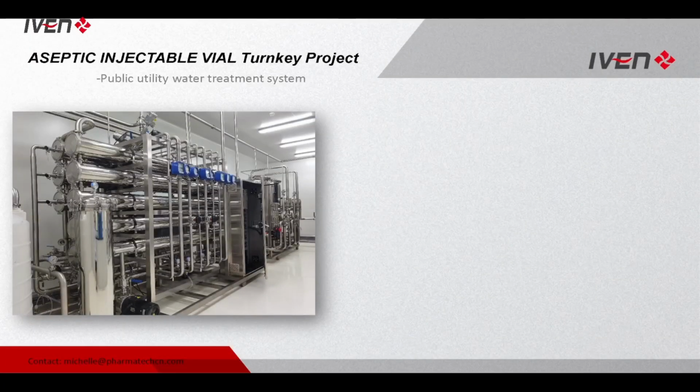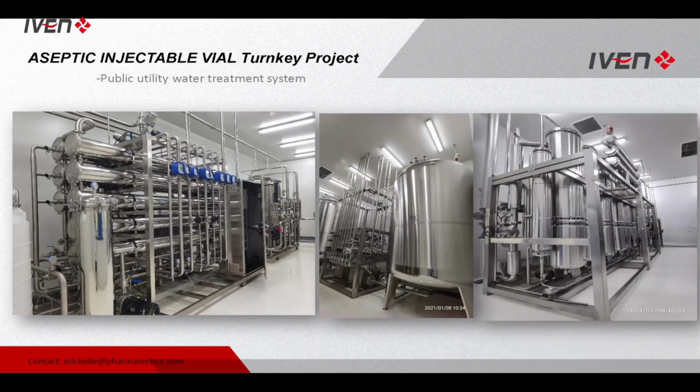For the injectable vial projects, the water is very important. So we also have the purified water, the distilled water, and the pure steam generator and tanks to ensure control, making good water. For the water treatment system, we can also customize production according to your country's regulation, like EU GMP or US FDA.